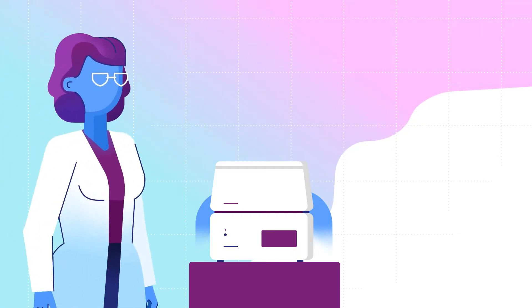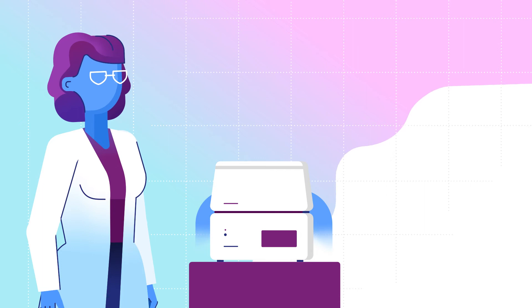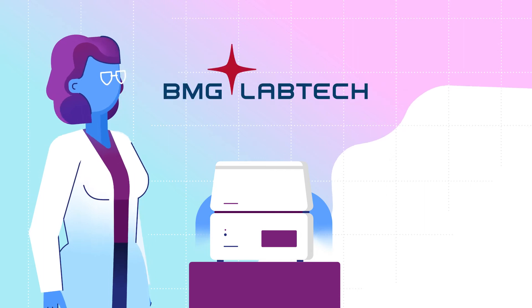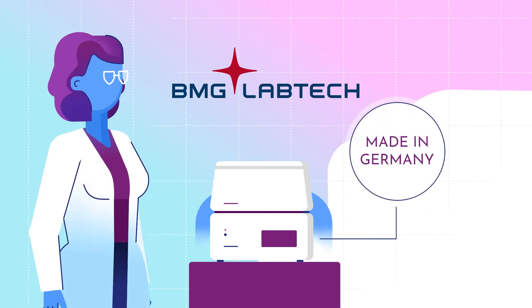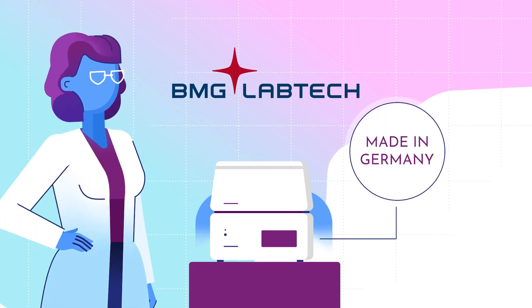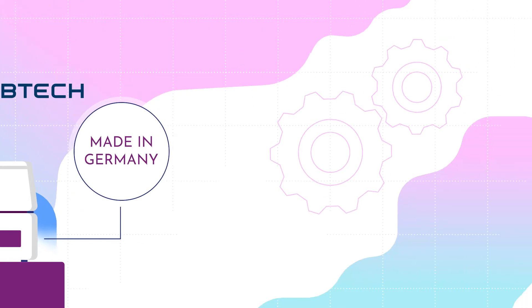And do not worry about reliability. With BMG LabTech, made in Germany, dependability is by design.